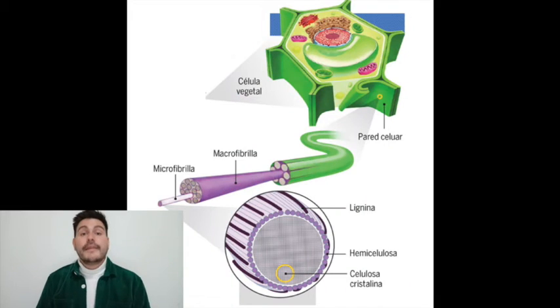For example, in this case, agave and garlic. The agave and garlic samples have different compositions in the cell wall: lignin, hemicellulose, and cellulose, as we can see in figure 1. But the only part of this composition that is crystalline is cellulose.